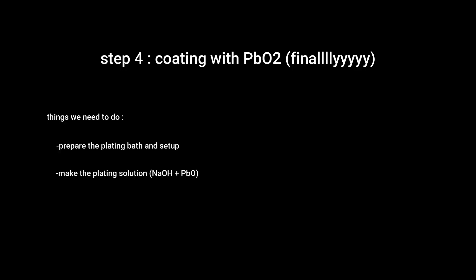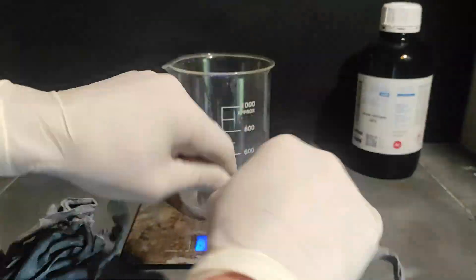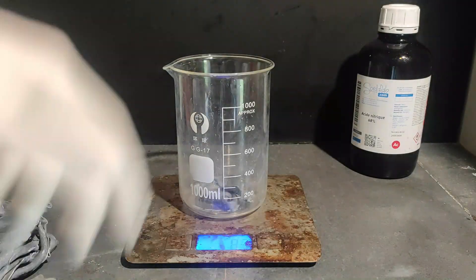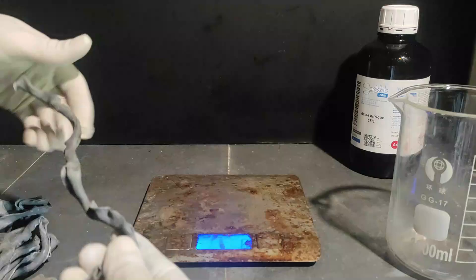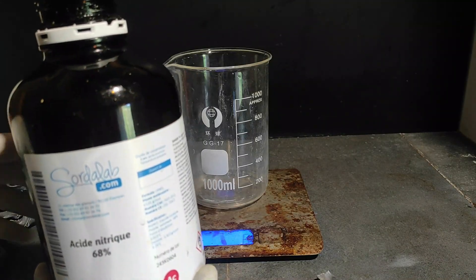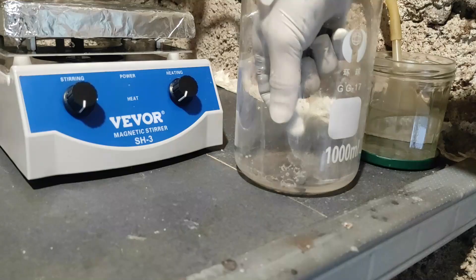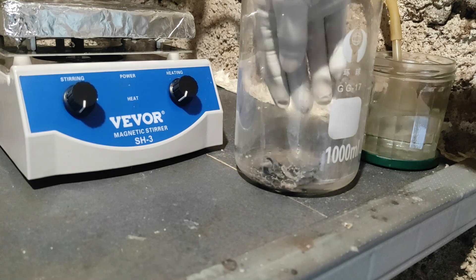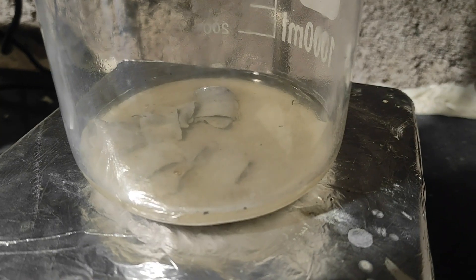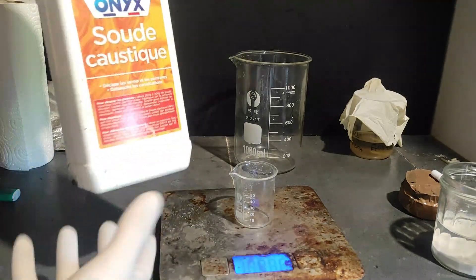Now we need to prepare the lead dioxide coating solution. Most people on YouTube use lead nitrate or just plain sulfuric acid, but we're going to do something better. I measured about 40 grams of lead metal and added an excess of nitric acid to dissolve it. While lead metal itself is not too dangerous, the lead nitrate we are making is very toxic because it can penetrate through the skin, so wear gloves. For the reaction to work, we need to heat the beaker until orange nitrogen dioxide gas is produced — make sure not to breathe it as it's toxic.